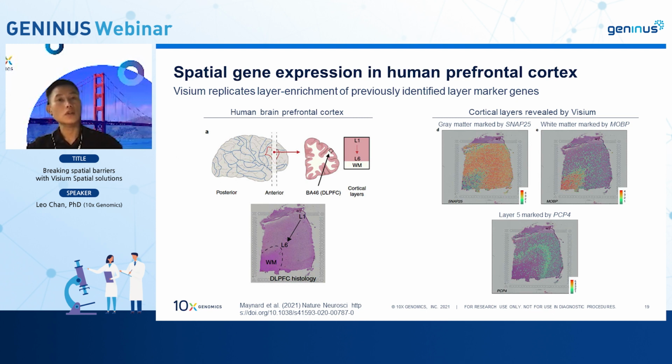By using histology, graph-based clustering, and layer marker genes, and through spatial technology, these authors were able to annotate the 6 layers of the cortex and identify the extensive layer-enriched expression signatures and redefine associations to all the previous markers.